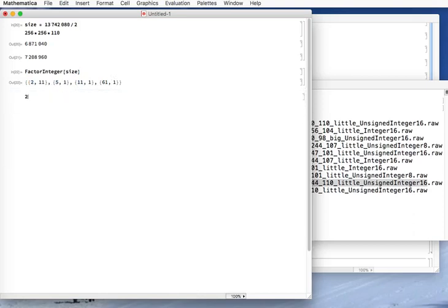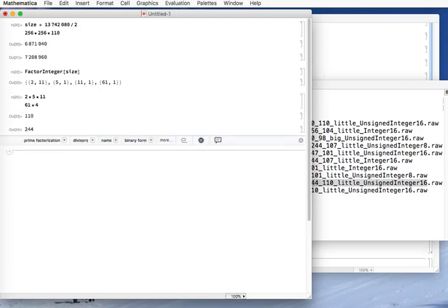So let me go ahead and say that the number of rows is, I could do something like use that 5 and that 2, one of the 2s and the 11s, and take care of my number of slices. Leaving behind a 61. Probably a 4, 244.